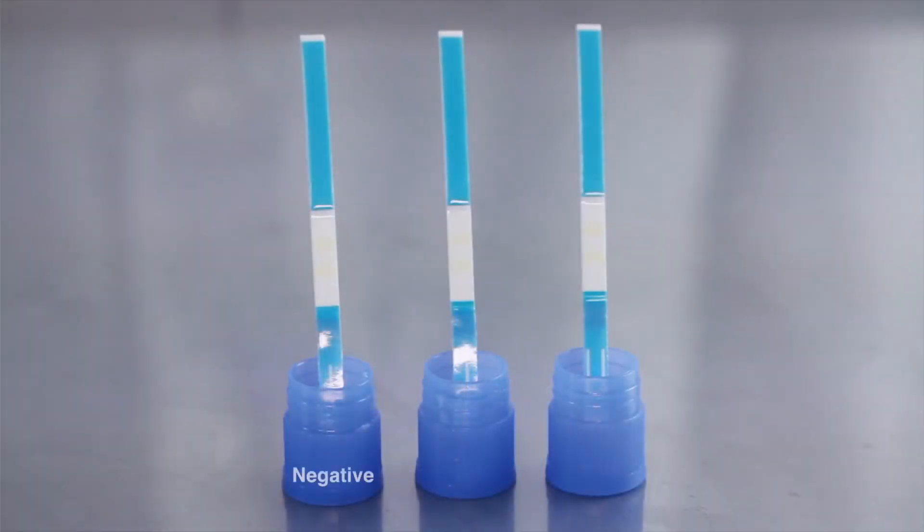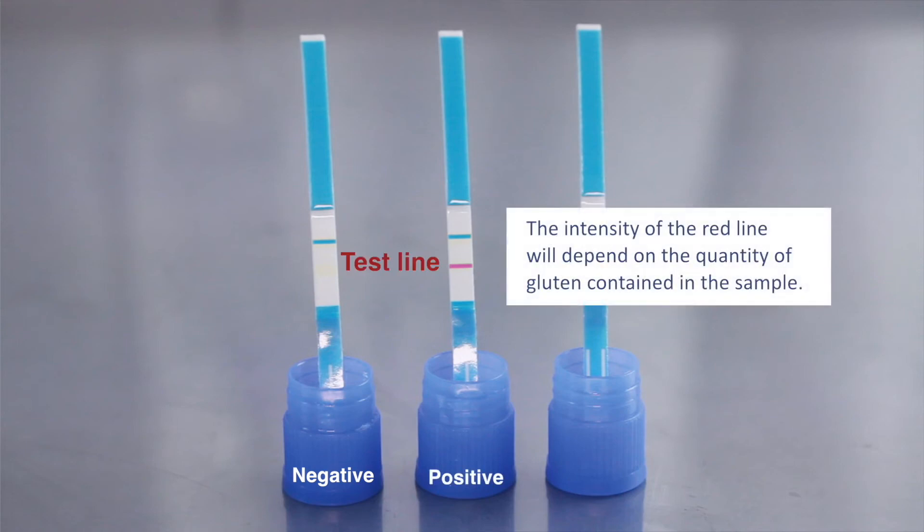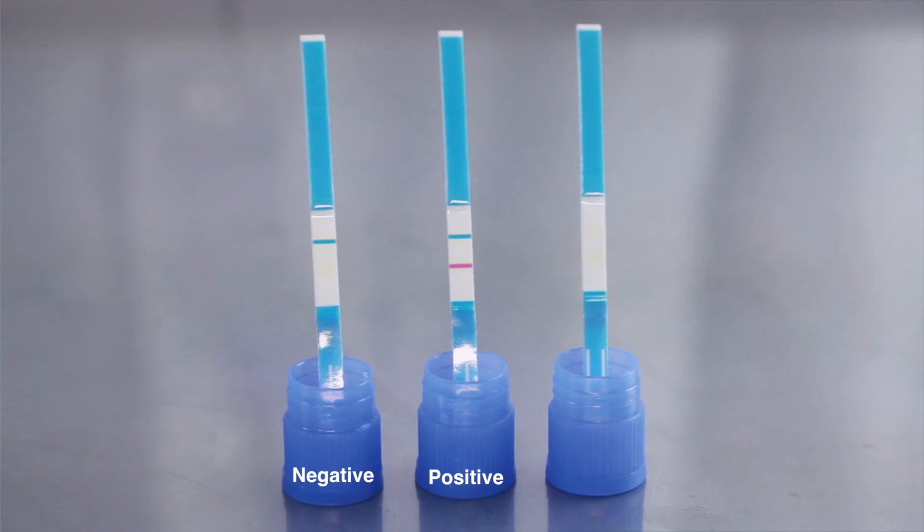For a negative result, a single blue line or control line appears in the central part of the test. For a positive result, a red line will appear below the blue control line. If the blue control line does not appear, the test is considered invalid.